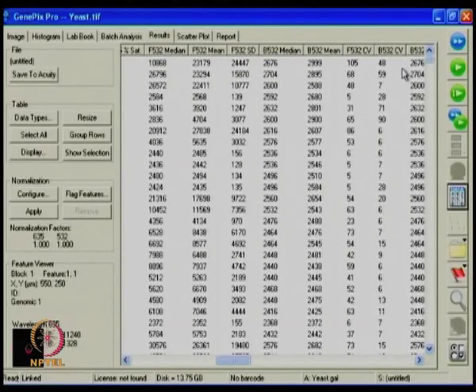Each column signifies different things, for example SD for standard deviation, CV for coefficient of variation, and then the different channels. In this fashion the results will be output: first image acquisition controlling the part, then allowing you to align, and then do the analysis. These are the basic steps which everybody wants to do in microarray work. Once you see the images and the results, you have different columns available to you. After that, what is the next thing to look for?